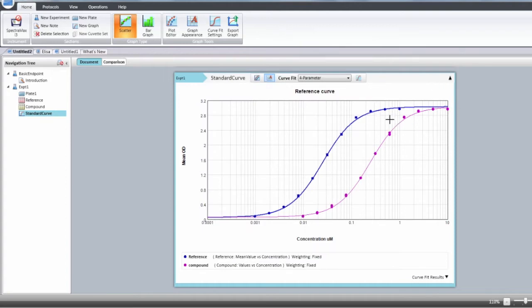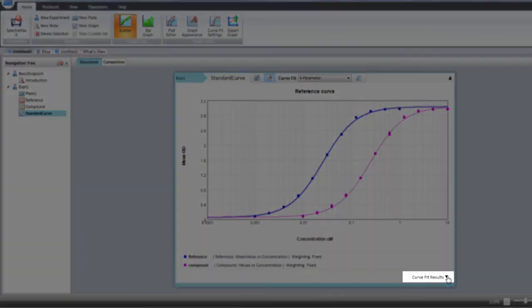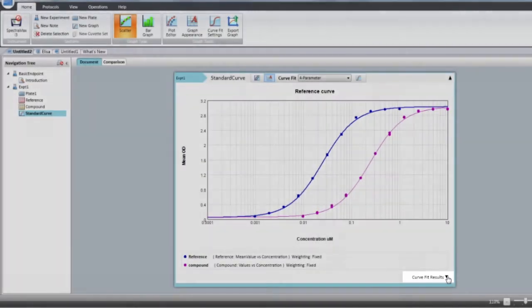In order to see the parameter describing the curve, you have to select this little arrow.